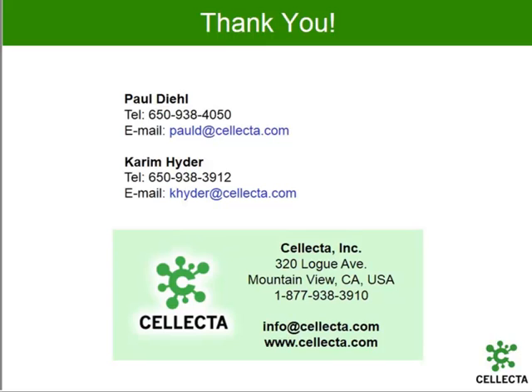Okay. And we have time for just one more question. Could you provide some examples of the CRISPR knockout in patient-derived primary cells? Well, that was actually the example that I gave. These were patient-derived primary cells. They are a blood cancer cell line, but it is patient-derived, and they were passed through mouse, and then the cell line was derived from that. And as I said, we have the resistant cell line and the sensitive cell line.